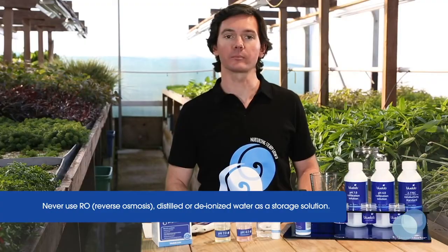Remember, never store your probes in reverse osmosis or RO, distilled, or deionized water. These types of pure water can change the chemistry of the probe glass and cause damage to your probe.